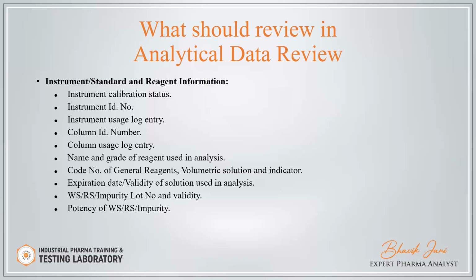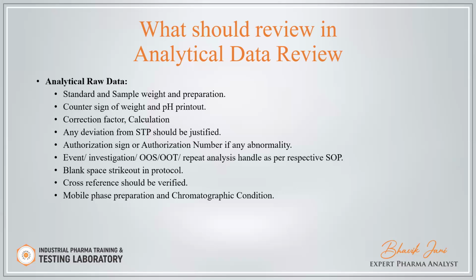You have to check all the logbook entries or instrument entries before the start of analytical raw data review.